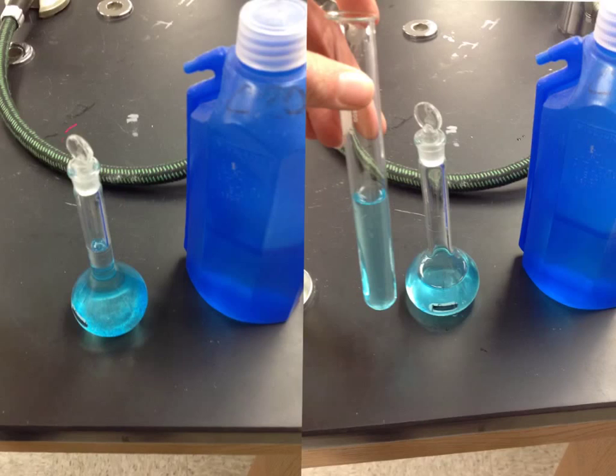Ideally, you would put this little stopper on and move your flask upside down and then back right side up, but we don't have enough of those stoppers to go around, so more than likely your group will end up putting what's called parafilm, this little waxy film, on the top to cover up the mouth of the flask and mix that solution up.